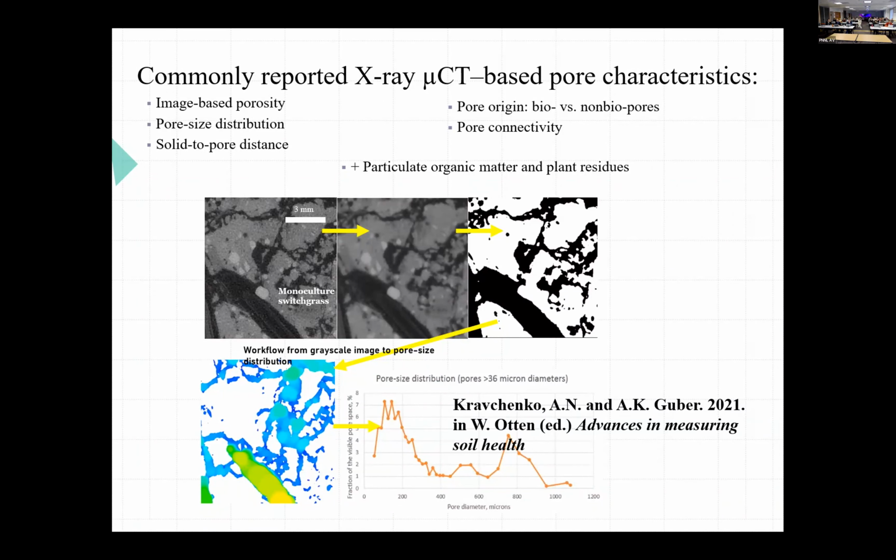One thing I want to bring to your attention is one of the limitations, or at least what we encountered as a limitation in working with X-ray CT: each of these steps, for every image analysis process for every soil sample, would be the steps. Yeah, these are the steps.